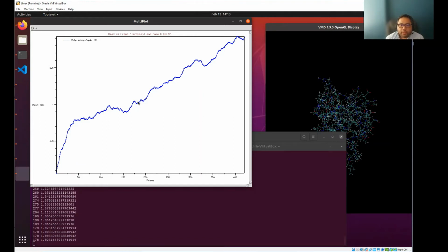So if we were to eventually see it plateau somewhere, so it just stops out, that just means there's no longer any structural perturbation. This might be a sign that we've found the right conformational structure. So now that I see it's continually changing from its previous step in the simulation, it's telling me that it's still evolving, right?